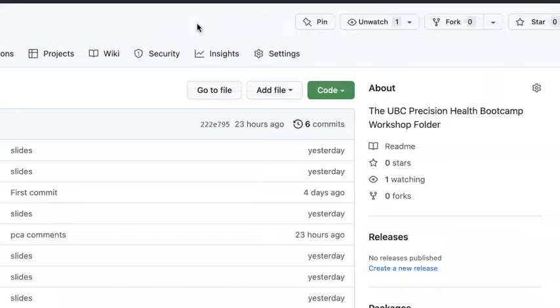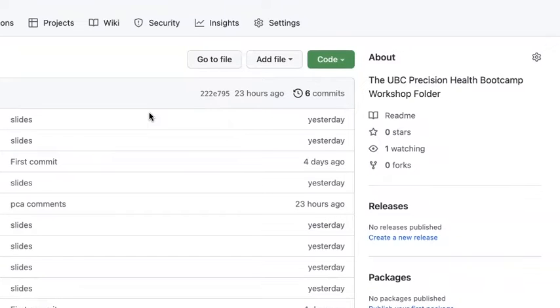So after talking with the people who are here in person, I realized that they think it's much easier for you to go through and learn if you have the completed worksheet with you, as well as the fill-in worksheet, so you have everything there, but you can also see me code along.